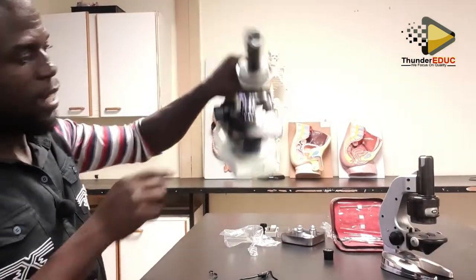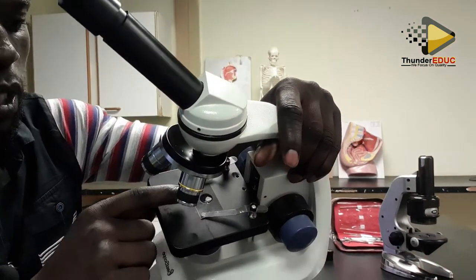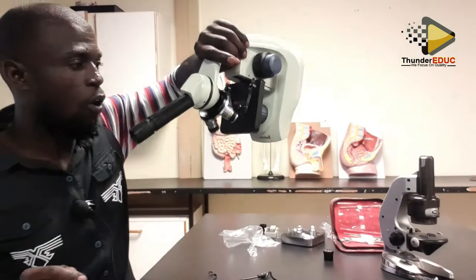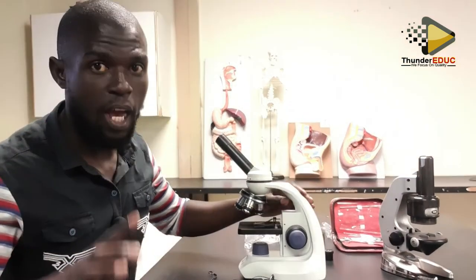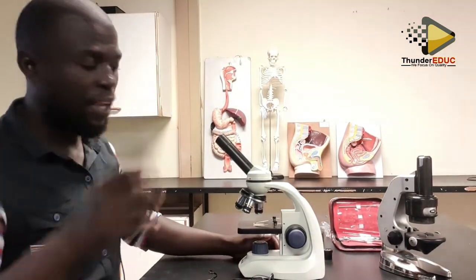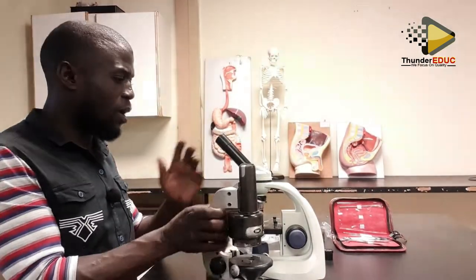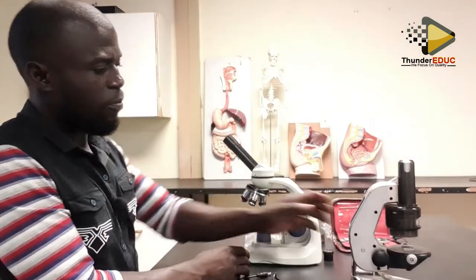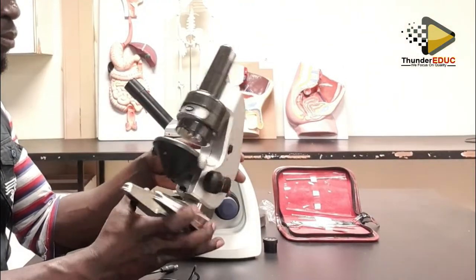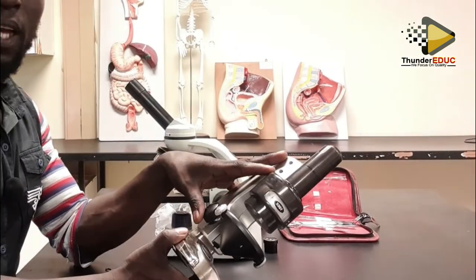You see, the slide is there, the glass, but it cannot fall. Why? Because the clips hold the slide in position. Now we are seeing another microscope here. How about this microscope? This microscope is also another kind of microscope, but it has the same things that this one has.